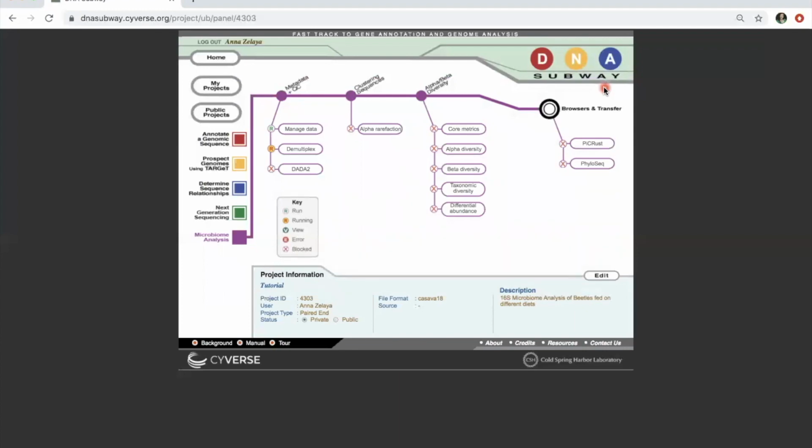You can go have lunch, go have coffee. You can watch other things or do other work. You can even close down your computer. It will still keep running in the background. This step does take a long time, so you might want to just go ahead and work on other things or take a break. So a quick description about what the demultiplex step is doing.